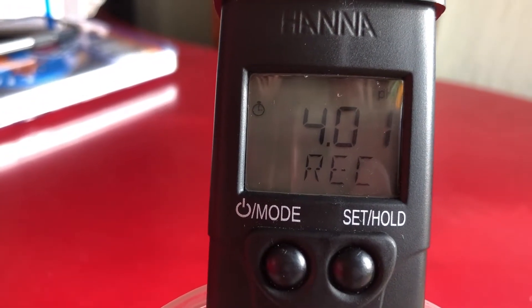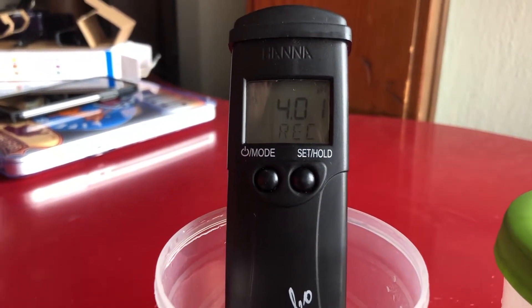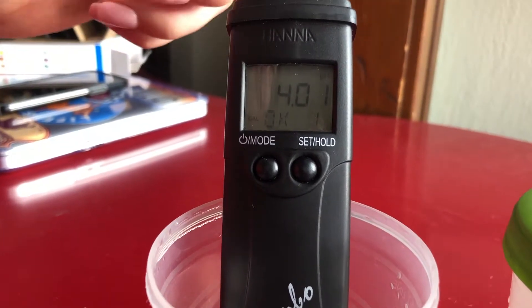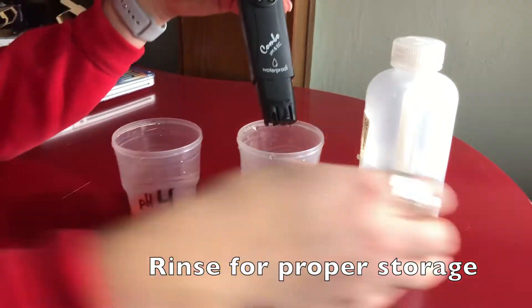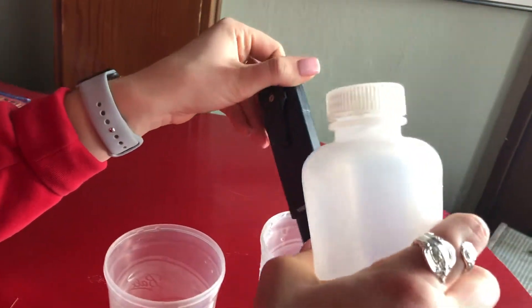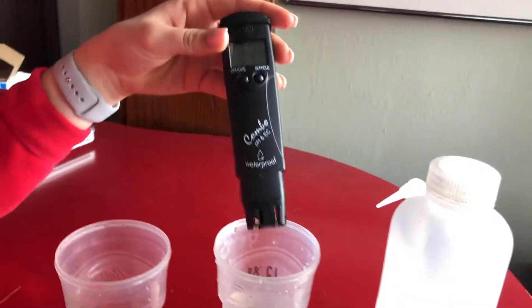It'll say it recognizes it and the calibration symbol will blink — that's how you'll know it's calibrating. Wait for it to flash across the screen, then it'll go back to the main screen and you'll know it's calibrated. Uncap, rinse off the tip of the probe with distilled water, and you're done.